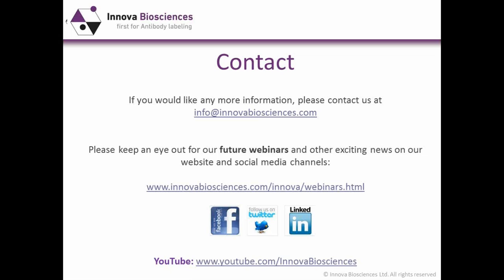Okay, so our next question is, the antibody that I want to label contains BSA and I only have a small amount of it available. You mentioned that the Lightning Link kits will not work as well with BSA present, so is there anything I can do? Yeah, there's quite a simple answer to that.